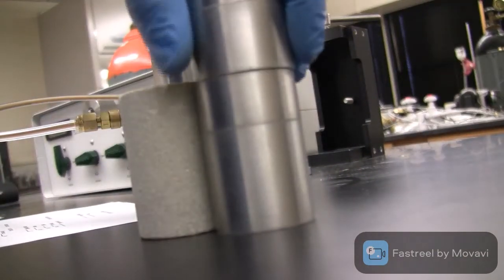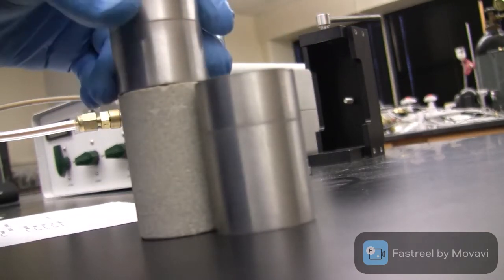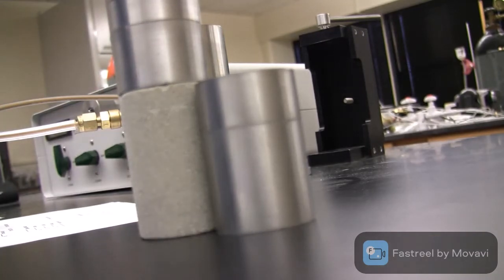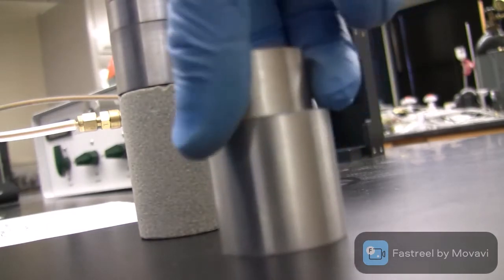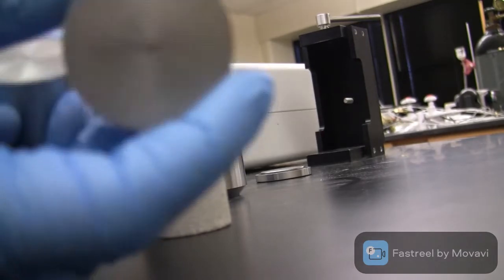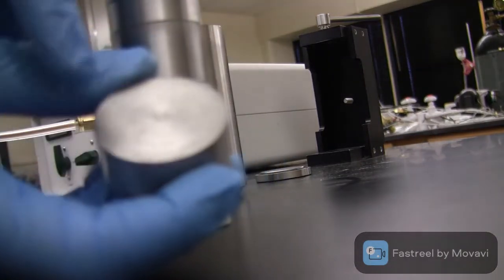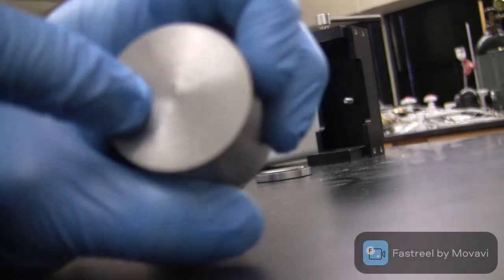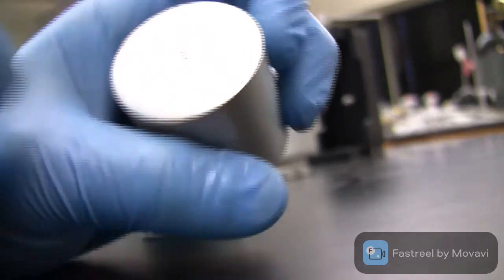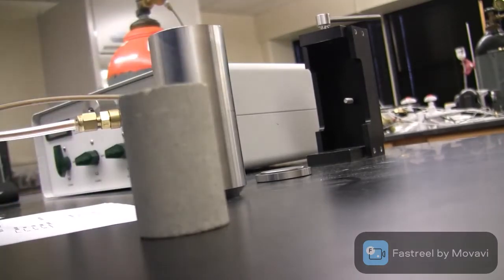So the rest of them, we need to put them with our core. And also you will need to record the ID of the stack of the pellets. These two pellets IDs are C and E. So on each pellet you will have a letter in the middle of the pellet. This one has C, this one has E. I'm not sure if it's clear or not. And the others are A, B, and D.